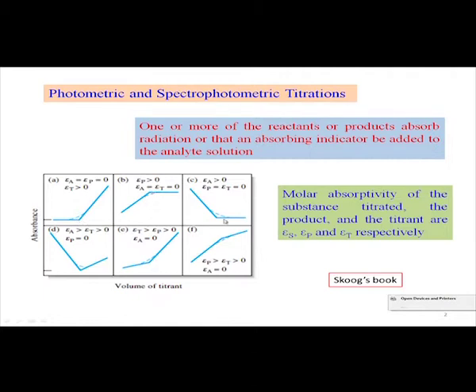So, this crossover, this crossover, this crossover and the other crossover. These are the most reasonable possibilities for all these titrations. So, any one of these can be useful for your color absorption. So, we get this as your endpoint.